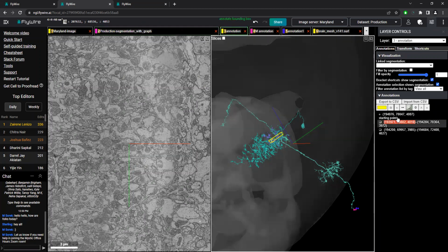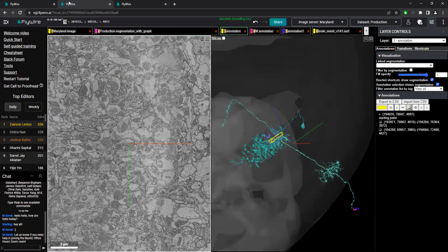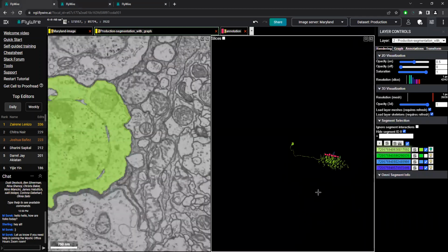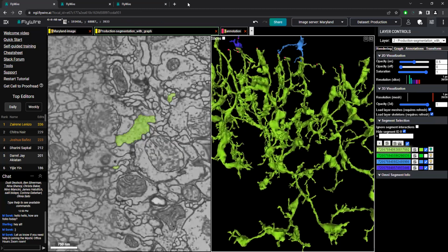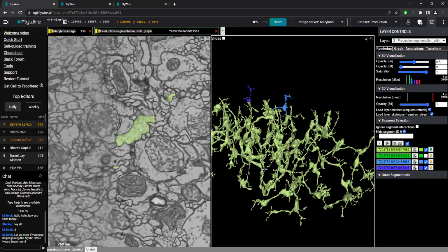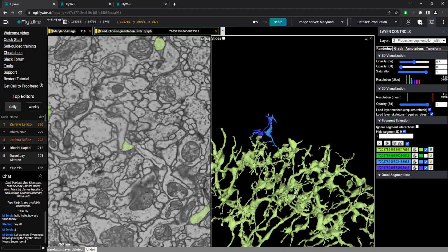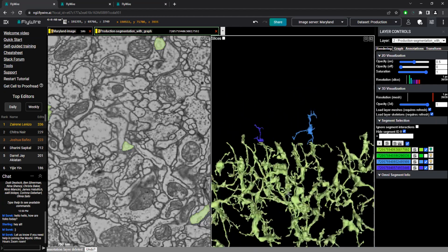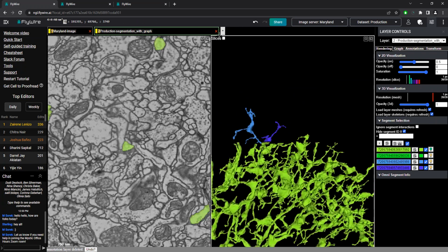Let me think about this. I don't see them at all. When you place them, I place them and I get the ID, but I don't see them in the 3D or 2D. Okay. What I'll do is delete this annotation, and we'll do a quick process of how I'm doing the annotations, and maybe you can see if you're doing something different.